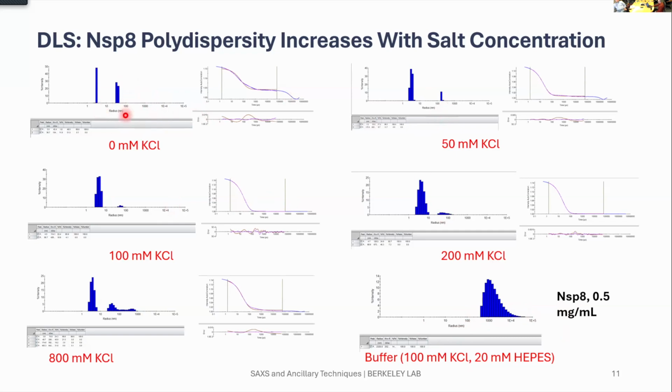So basically, if we see two things very separate from each other, it means polymodality. It's not always meaning that you have one small protein forming very big, huge things. It might mean that some other components, like some salt, can form bigger particles, or some bubbles can interfere with your analysis, or you indeed have some big aggregates, just a bunch of unfolded protein aggregates and precipitate in your sample.